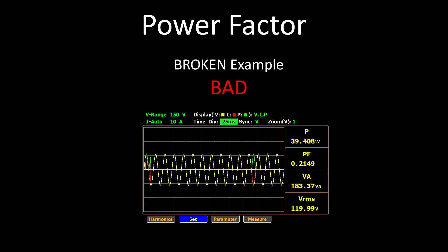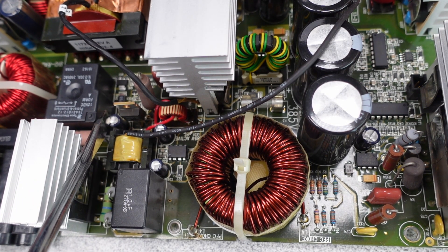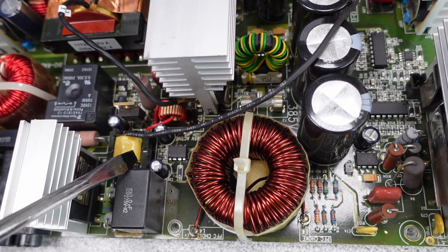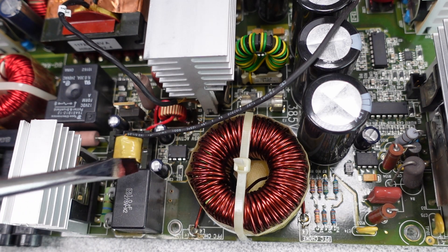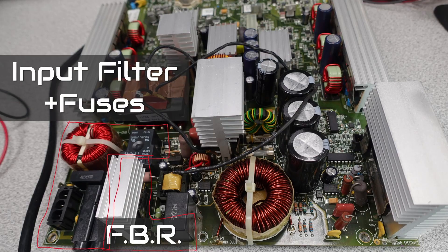The next step is opening up the machine, and wow is that a process. They didn't make this thing easily repairable, but small volume devices like this don't get the benefit of iterative design like polished high volume products. The whole machine is opened up and the circuit board city is exposed. The first thing that happens on the circuit board as AC power enters is some protection circuits and filtering — more likely to keep noisy signals made inside from getting out. There are transient suppressors for any over-voltage on the input side. This stage is also the first point of AC to DC conversion: a full bridge rectifier and a small capacitance.